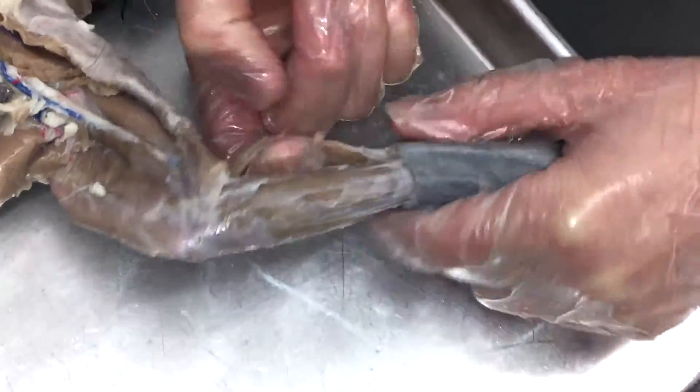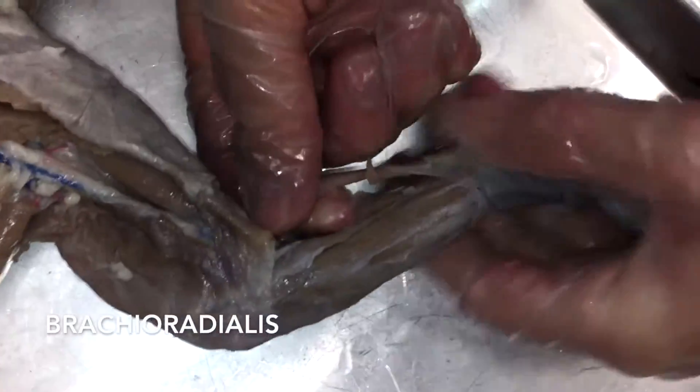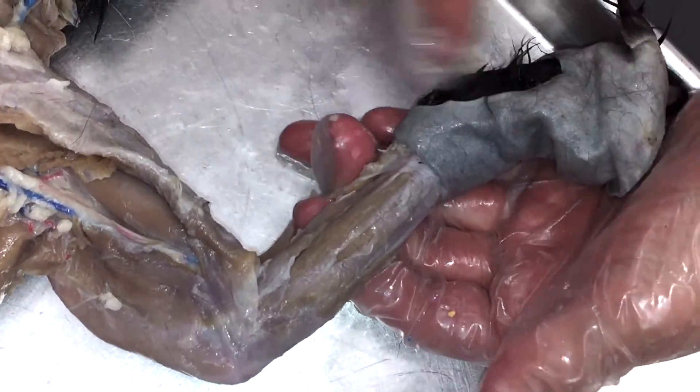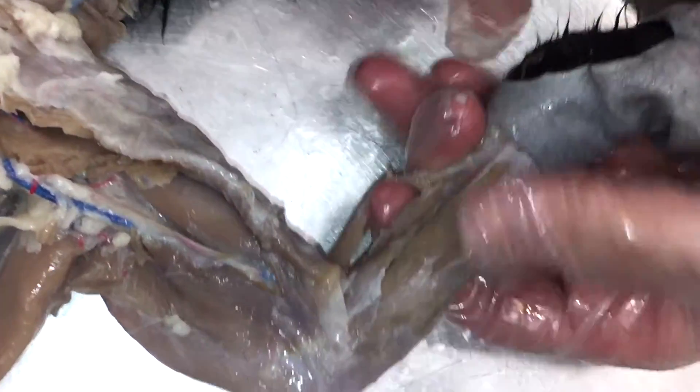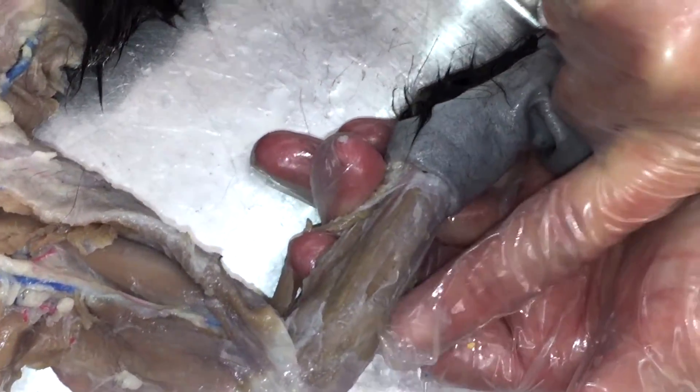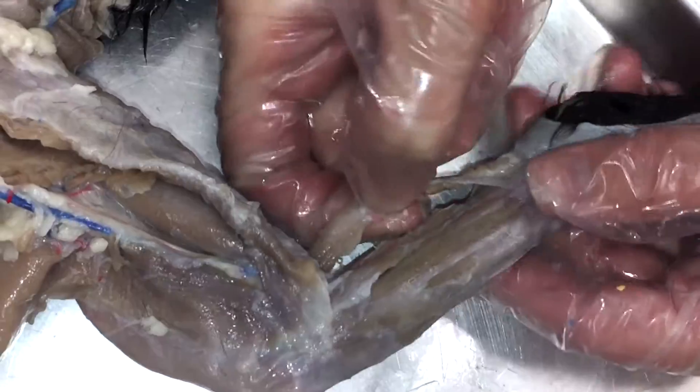This muscle that kind of hangs out by itself is going to be your brachioradialis. It goes from the brachial part of the arm to the thumb side — this is the thumb side. Kitty's thumb is closer to his head. The bone on the thumb side is going to be your radius, and the bone on the pinky side is going to be the ulna. So this is your brachioradialis.